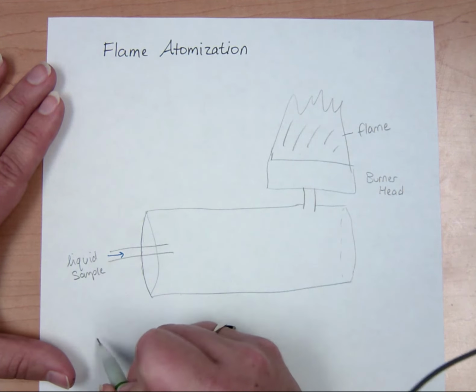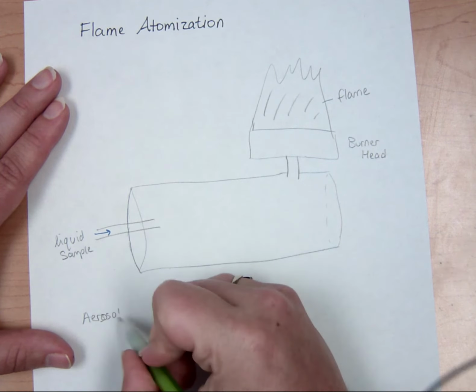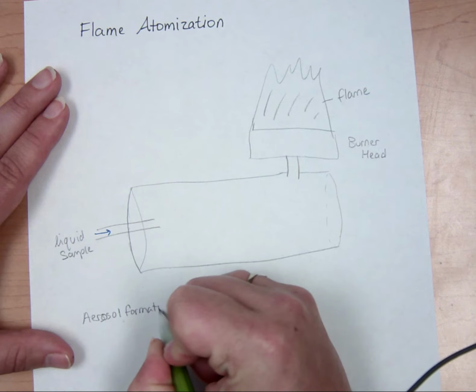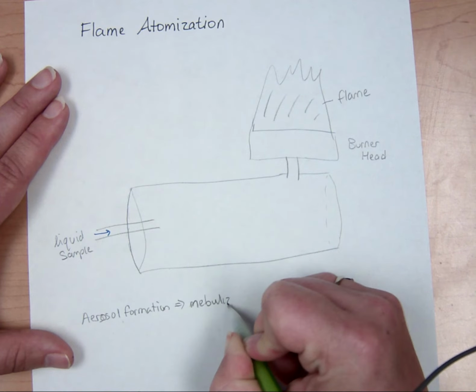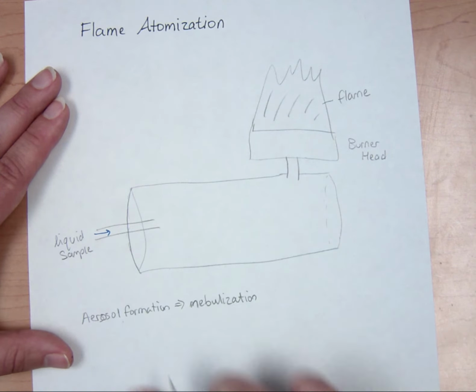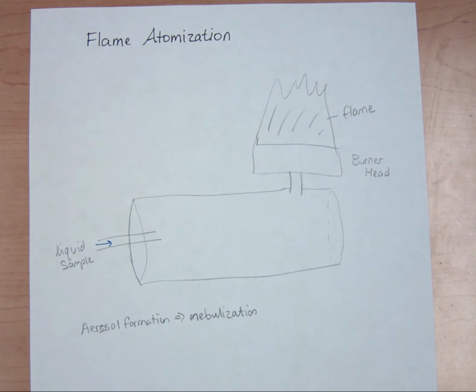So to do aerosol formation, we're going to need to do a technique called nebulization. And if you've ever been with someone that's getting any kind of a breathing treatment where they've got a liquid solution and it's going to get vaporized in a way that they can breathe it in, you'll know that it comes with an air compressor, and it's basically pushing compressed air through the liquid in order to get it into some kind of a vapor. And that's essentially what we're going to do here.